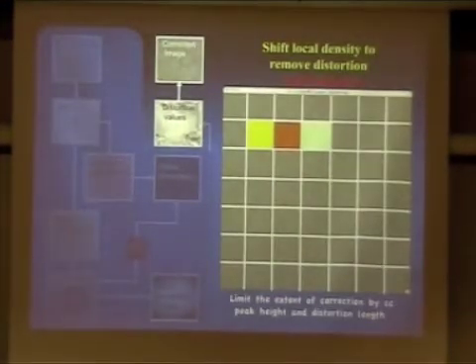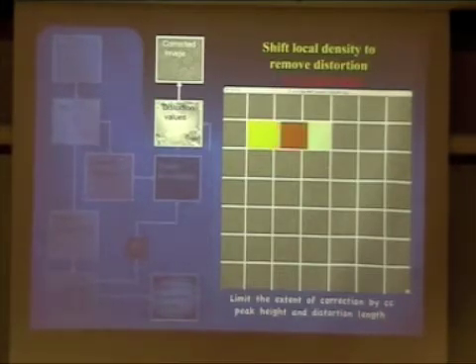So the next part, once we have the distortion values, we'll try to make the correction. The way it's being done is that the image is divided up into grids, and according to your distortion and how far it needs to move, it shifts each part and fills up whatever is missing with the edge value of the other.